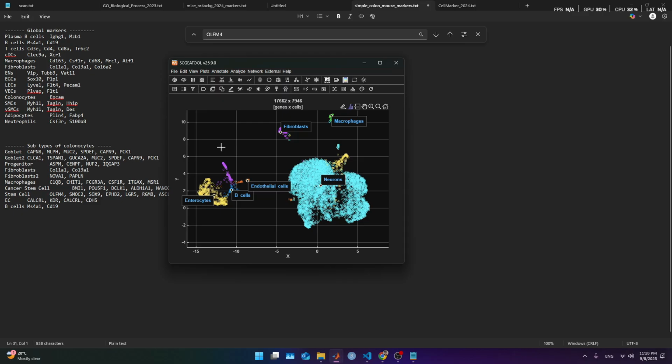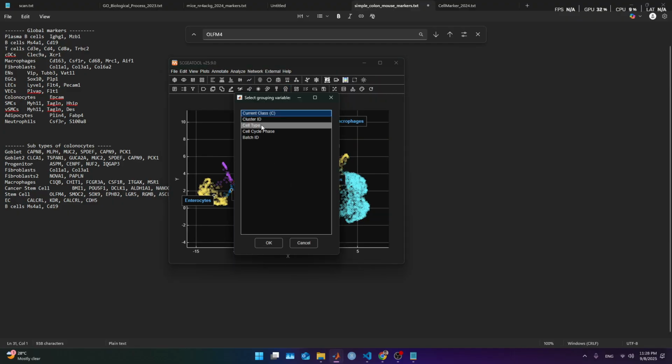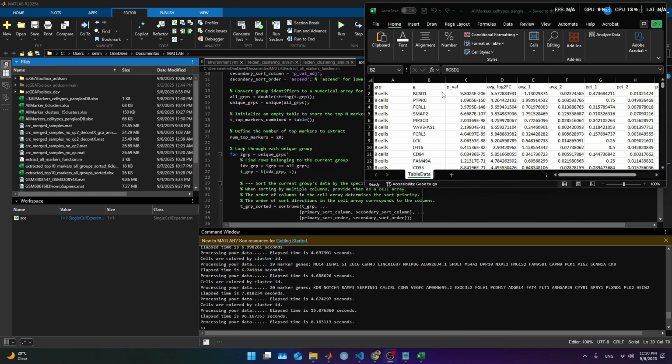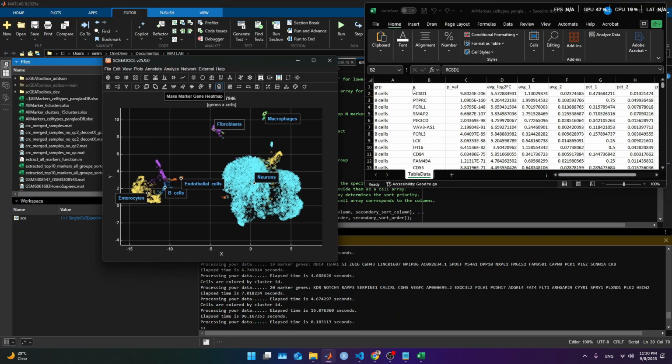Well, now if we want only to get the markers for these cell types, we do here find all markers for cell types, and we let it be, and I'm gonna come back in short. Okay, to finalize, I want to show, after using PanglaoDB as well, this is iterative. You gotta go back and forth in all the places because building the cell atlas is complicated, and we gotta get just the exact markers that our dataset needs. So what I'm gonna get from B cells is just the top maybe 5.